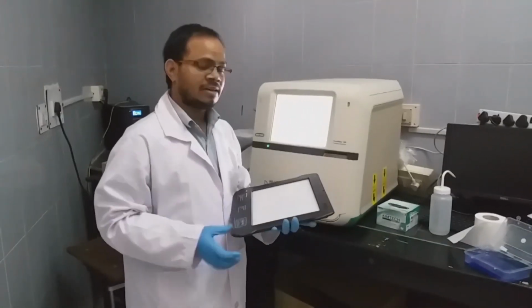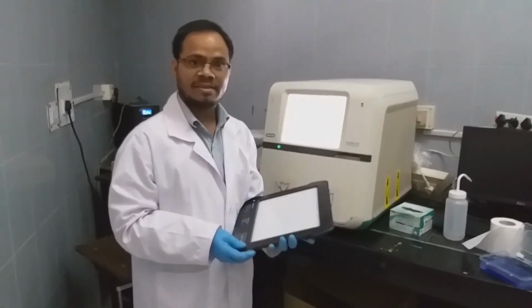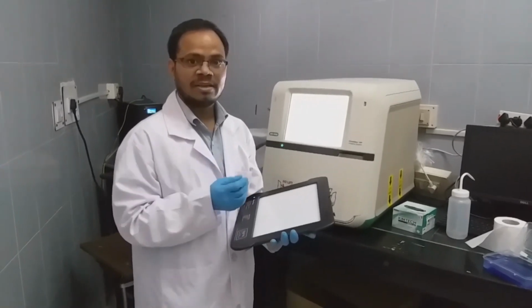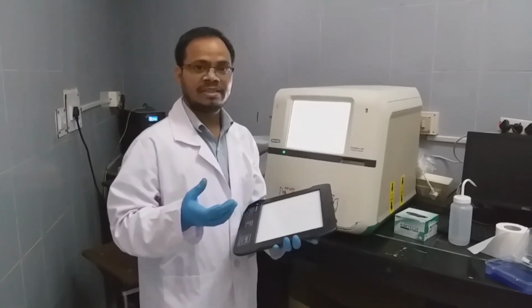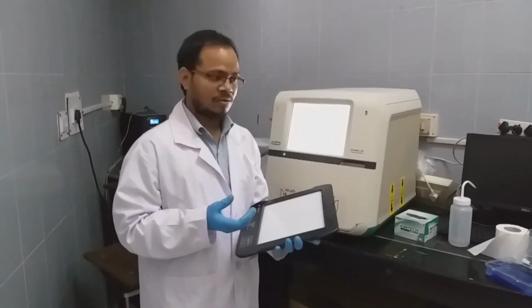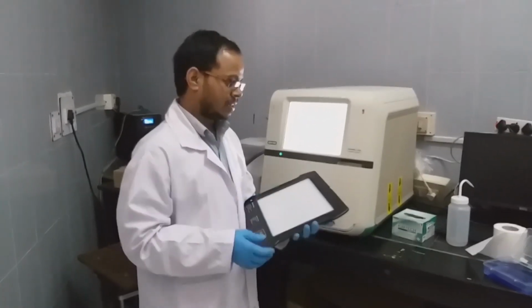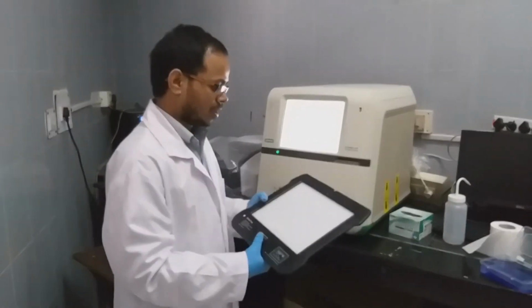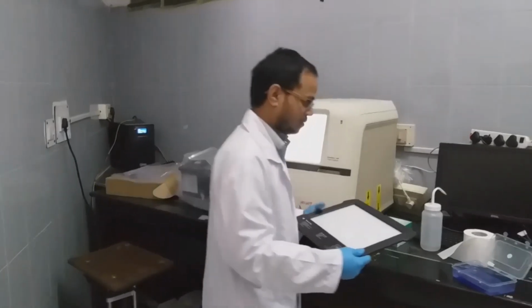There is another, gray or UV tray. There you can see anything fluorescent or stained with ethidium bromide, or blots, chemiluminescent blots. But for normal protein imaging, we can use this white tray. So I am going to keep the gel on this one.